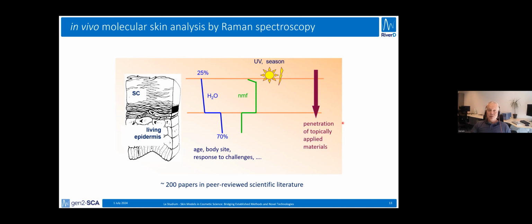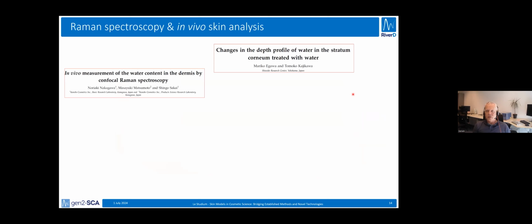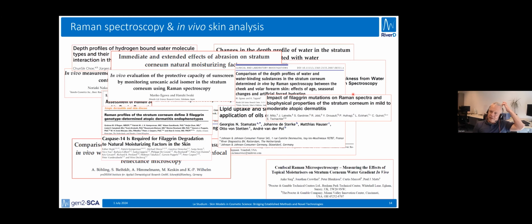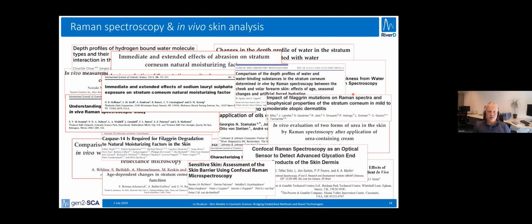Now, what you can do for molecules that are intrinsically present in the skin, you can also do for molecules that you apply to this, or for products that you apply to the skin and that penetrate into the skin. And this, as I said, has been described extensively in the literature, and still every year, quite a few papers are being added to this.